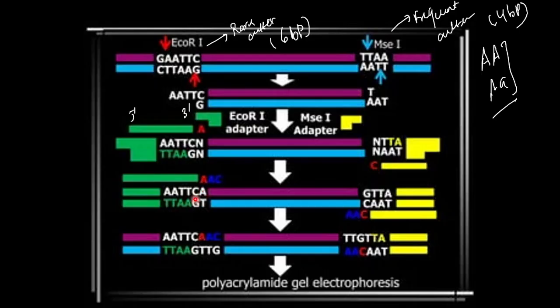To increase the specificity, you add two more base pairs, sometimes 5 base pairs. If you add AC, so in the complementary strand it is T and G, then there will be amplification. This is to enhance the specificity of the reaction.